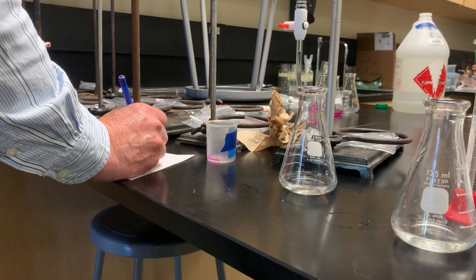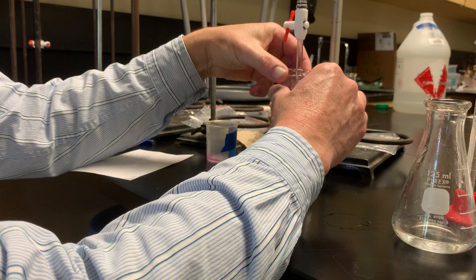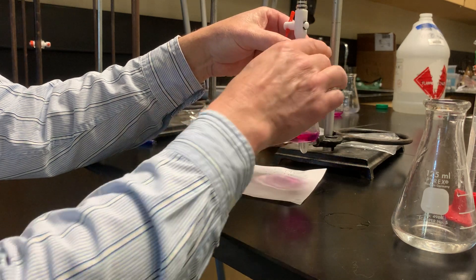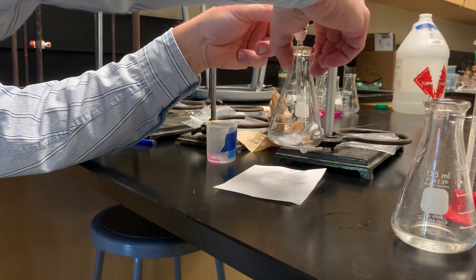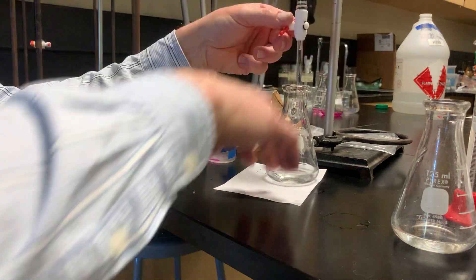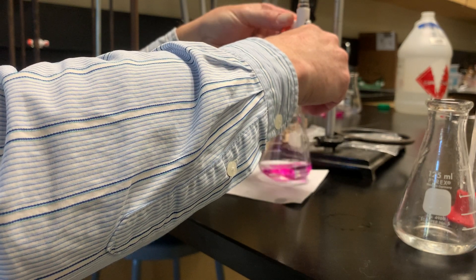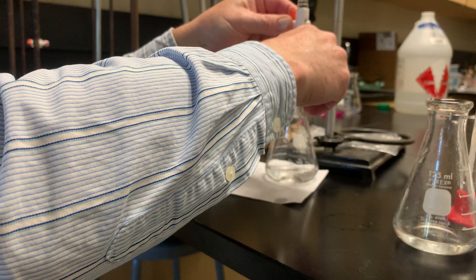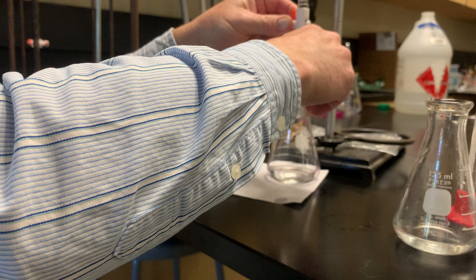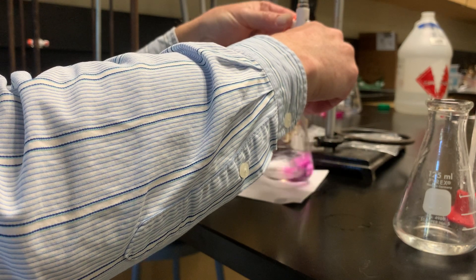Our final volume comes from adding liquid to create the pink color. We add liquid until the pink color stays, and when the pink color stays for a while, we want to do it drop by drop. That's how we get a very precise, light pink color at the endpoint.